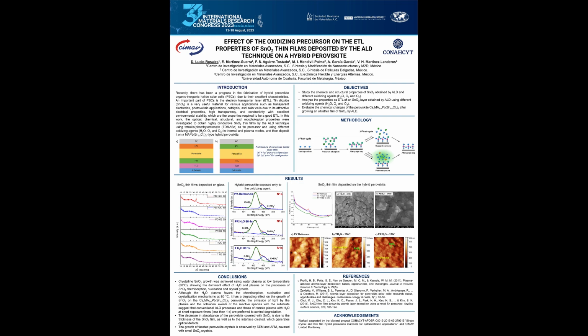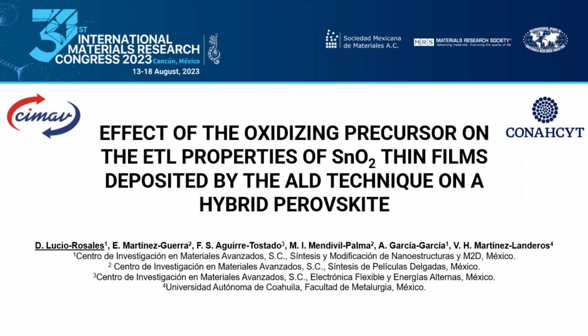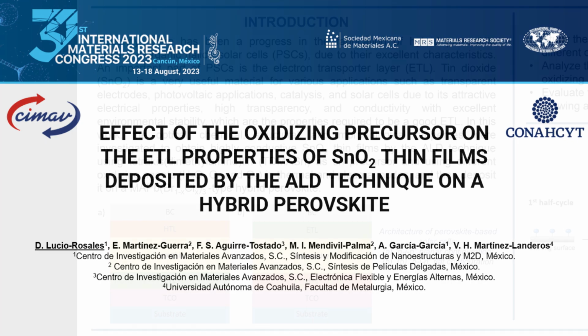Hi everyone. This work is called Effect of the Oxidizing Precursor on the ETL Properties of Tin Dioxide Thin Films Deposited by the ALD technique on a hybrid perovskite.